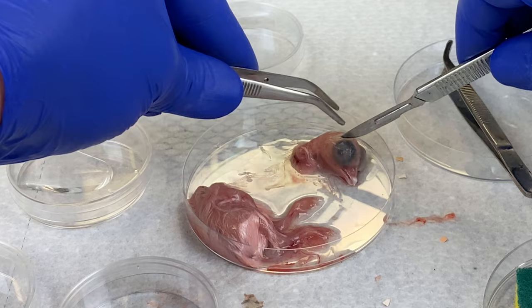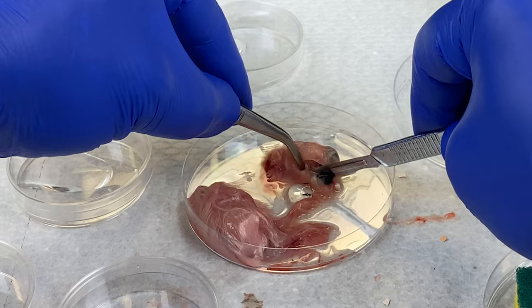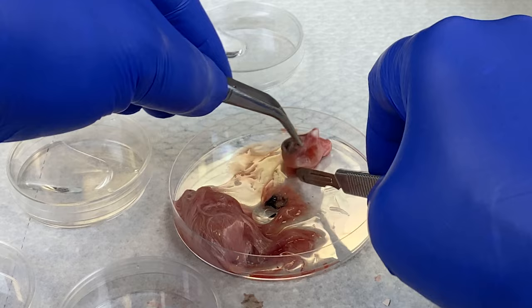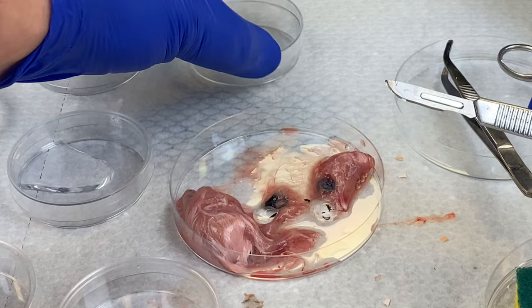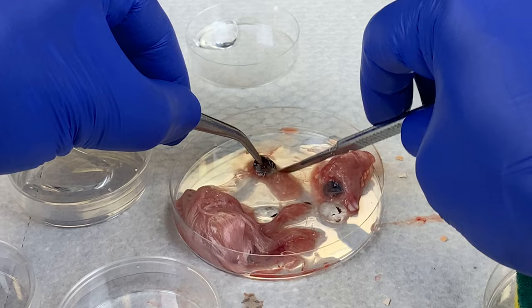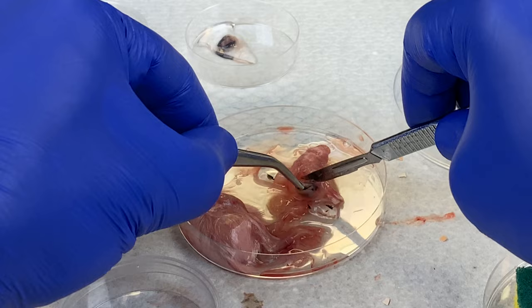I'm going to start with the eye. There are two eyes and I will harvest both of them. I'm looking for the black part of the eye. The eye is filled with a viscous, clear fluid similar to what's in your eye — we don't need that part, we want the black part. You can see the viscous part that has come out after the eye has been cut. I'll transfer both of them to the smaller petri dish, and try to remove any tissue that is not the eye before you transfer it over. We're going to leave behind that viscous fluid — there are no cells in there to culture.